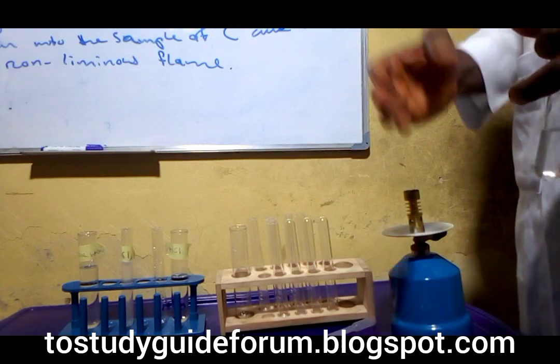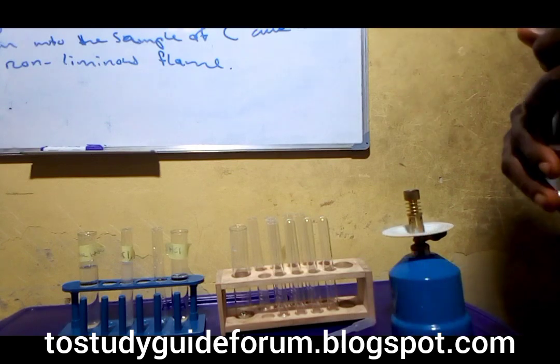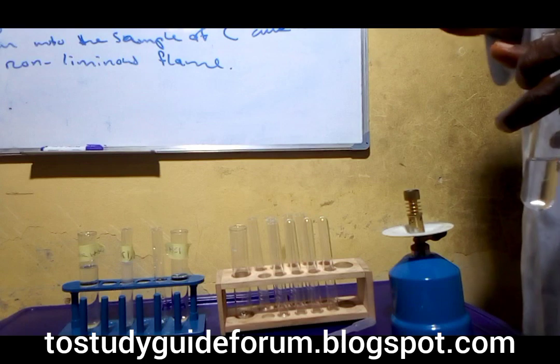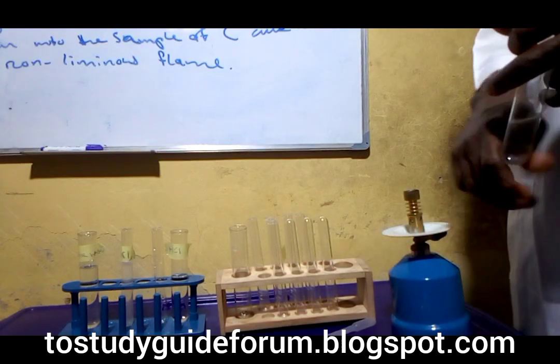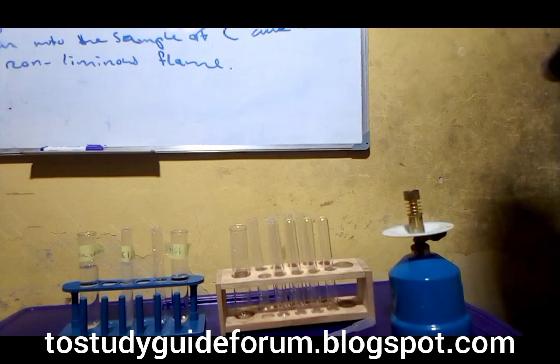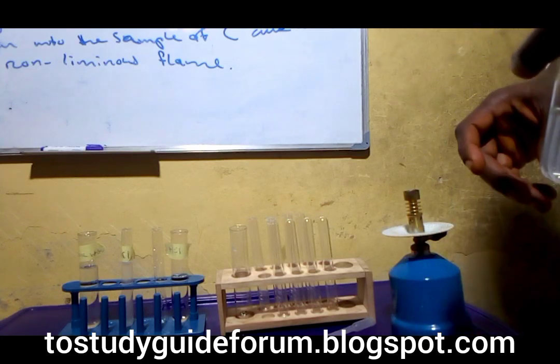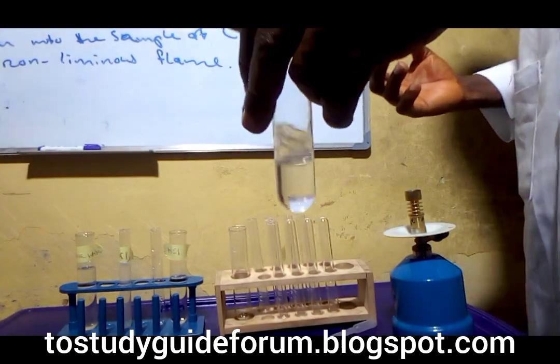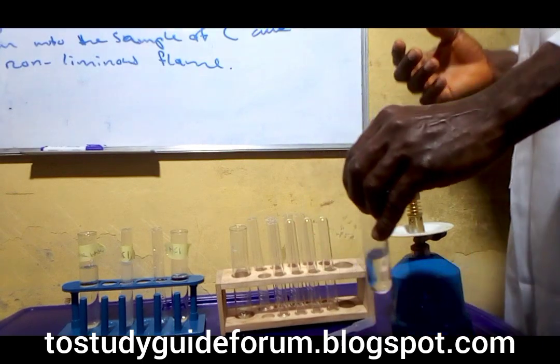All these things I mentioned are known to be soluble in every case. All the salts of potassium are soluble, all the sodium salts are soluble, as well as hydrogen trioxocarbonate. That is the possible soluble salt you might be expecting in this solution we have here.